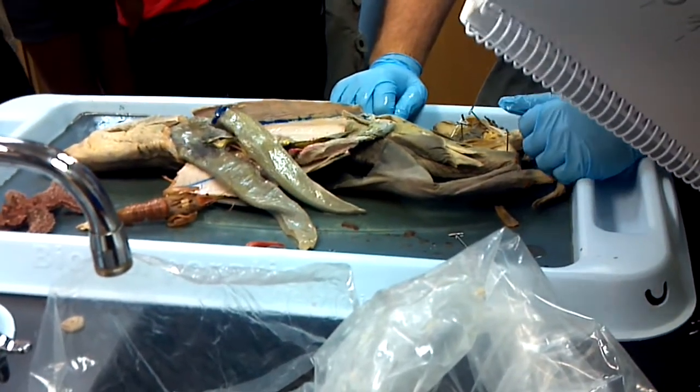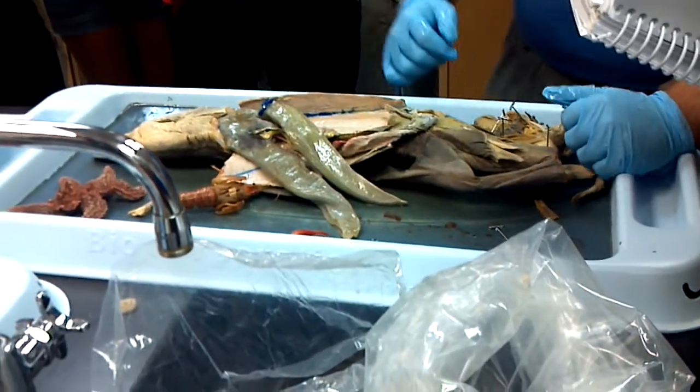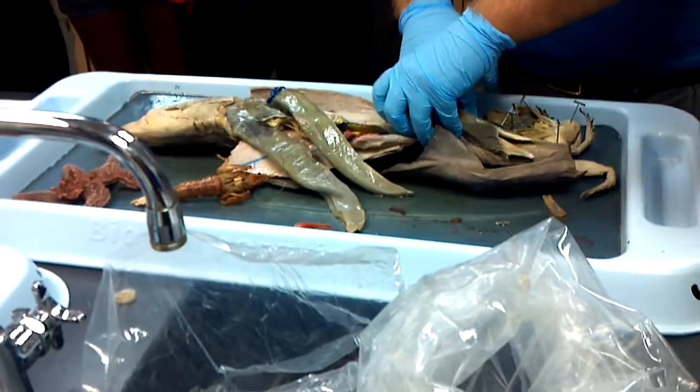I'm sure I missed some things — I'm just going off memory. Rectal gland — I missed that. It's right there.